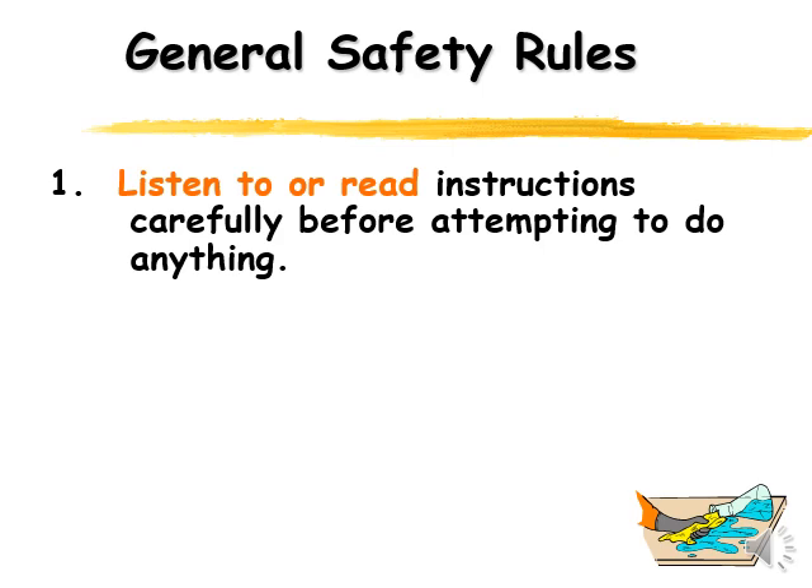With every lab we do when we're using chemicals, we're going to really stress that you wear your safety goggles or safety glasses. Make sure you're wearing your safety goggles when we're using anything that could get splashed into your eye or when we're doing any type of burning.